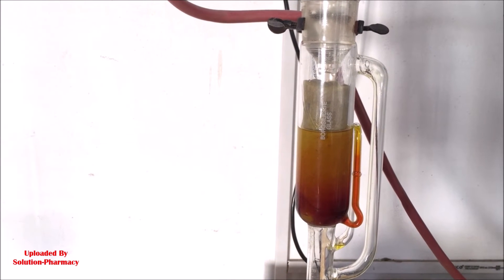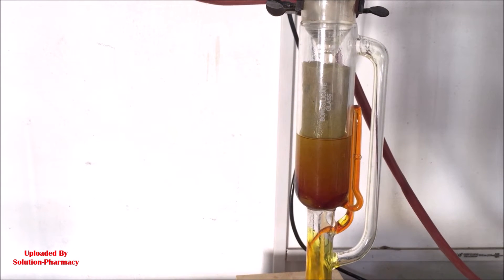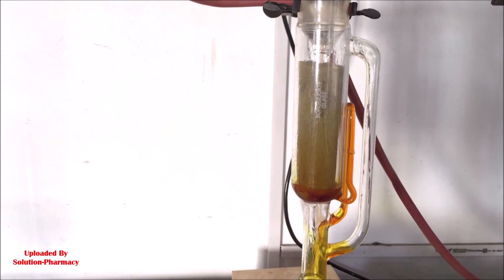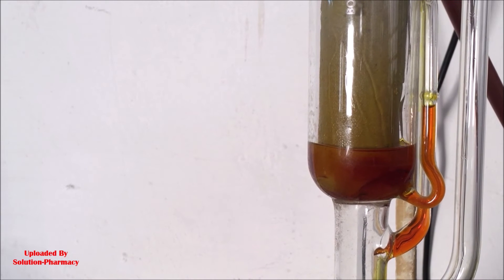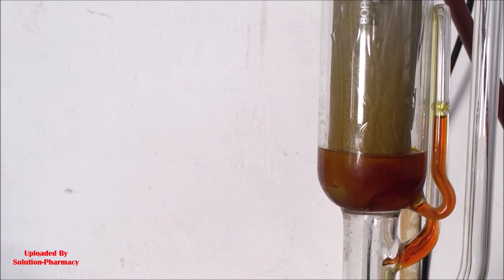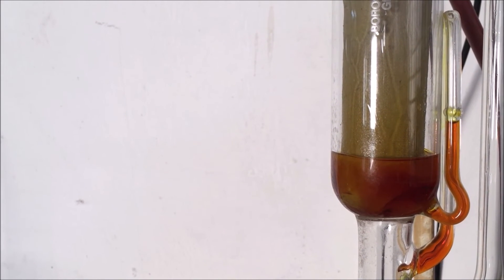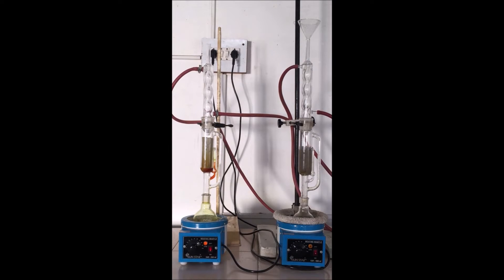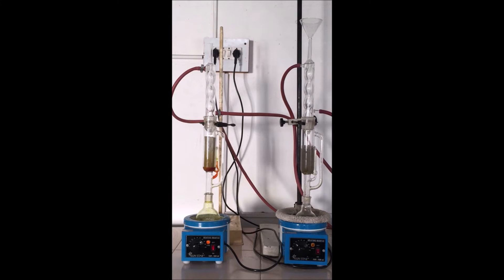When the chamber gets completely filled with sufficient quantity of solvent, this liquid extract returns back to the round bottom flask through the siphon tube and the chamber is completely emptied. This cycle of solvent evaporation, condensation of the solvent back into the chamber, extraction of the chemical constituents by the condensed solvent, and siphoning back of the extracted liquid into the round bottom flask — this cycle continues many times until extraction is complete and the final extract is collected in the round bottom flask. This extraction method is also known as the hot continuous extraction method. An advantage of this method is that only a small quantity of solvent is required because the solvent is recycled.